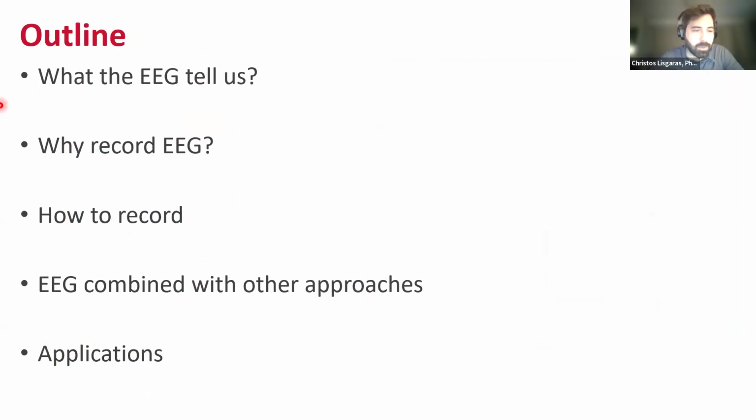Here is the outline of my talk. I'm gonna start with some simple questions. What does the EEG tell us, and why do we need to record the EEG? The focus is gonna be on animal models. How to record the EEG. I'm gonna go over the approaches that people have used. And then I'm gonna transition and talk about how we can combine the EEG with other approaches that are being used in neuroscience research. And last, I'm gonna talk about some applications.